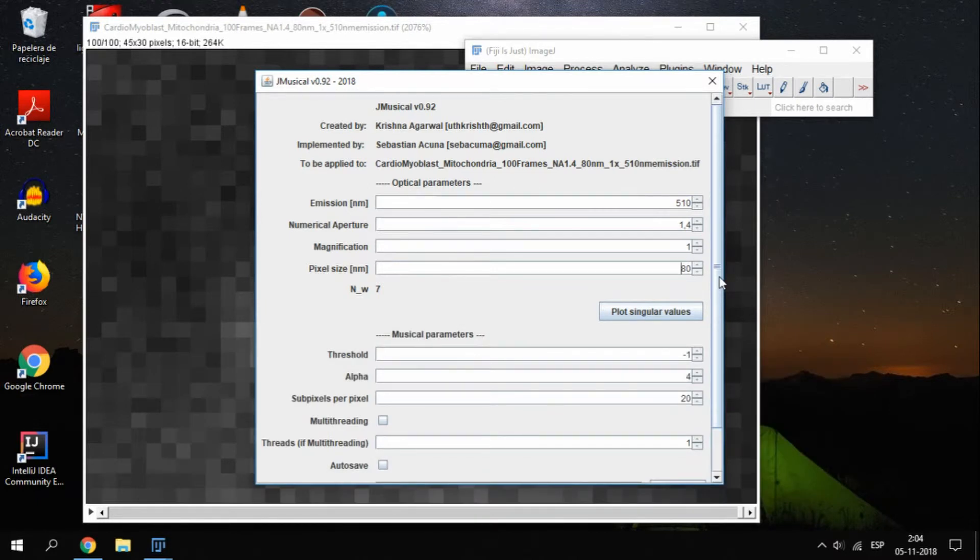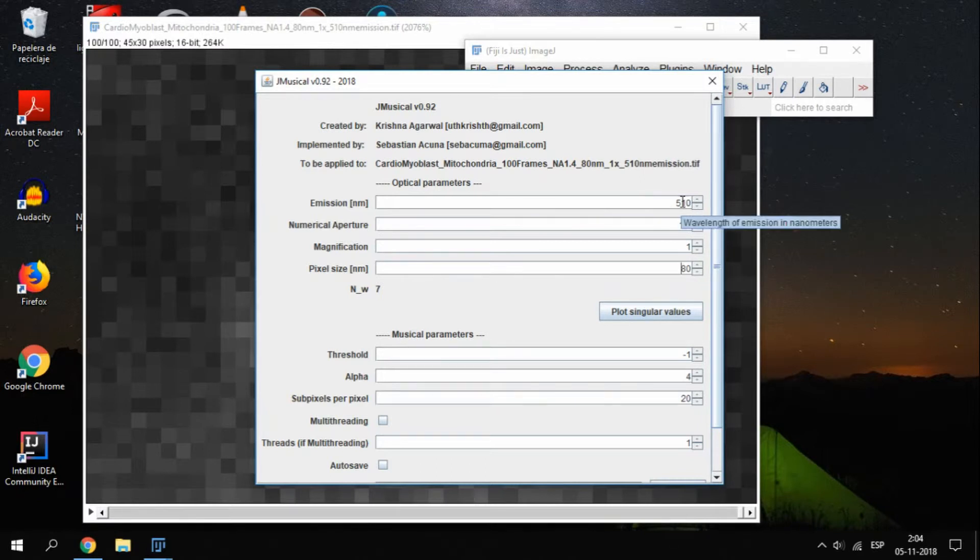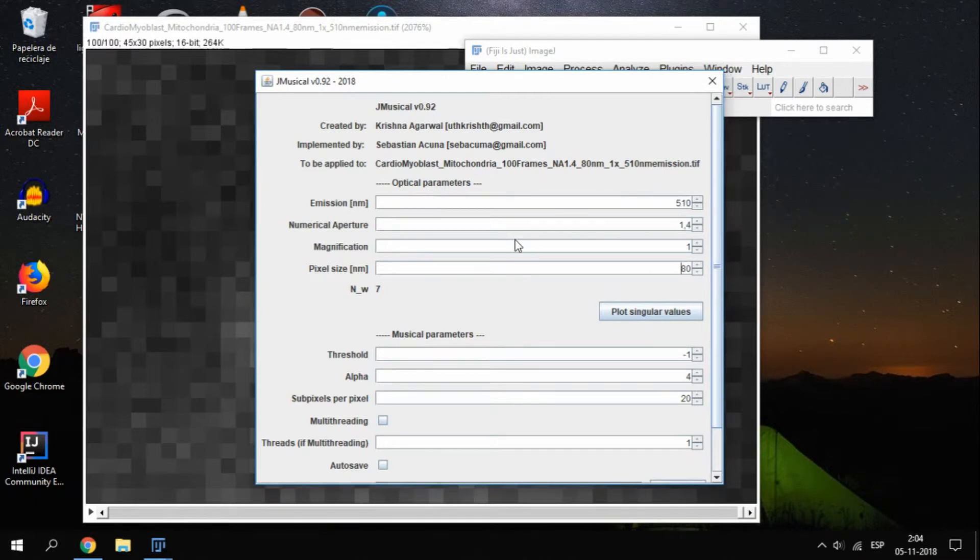If, in the future, you are not sure about the parameters, you can place the mouse over the field and read the small description of it. In case you are wondering about nw, this is a value used by musical, and it's computed automatically from the parameters, so you don't need to worry about it.